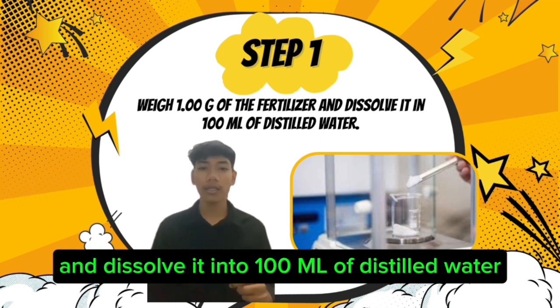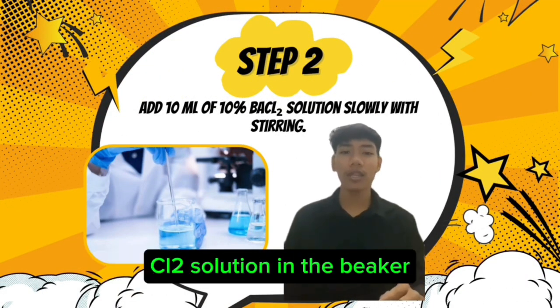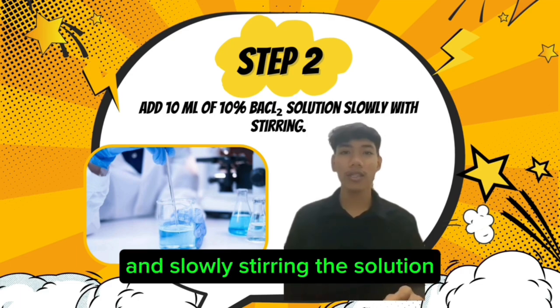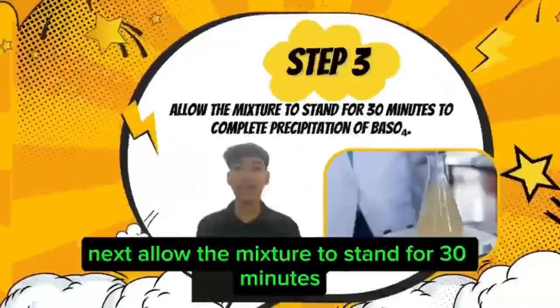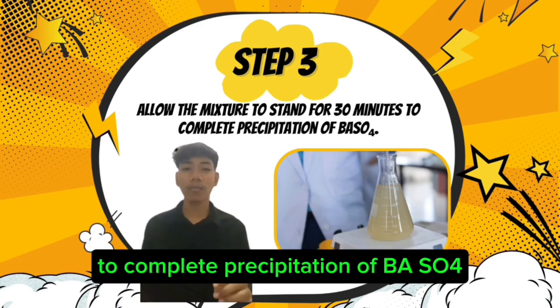ml of distilled water. For step number 2, add 10 ml of 10% BaCl2 solution in the beaker and slowly stir the solution. Next, allow the mixture to stand for 30 minutes to complete precipitation of BaSO4.